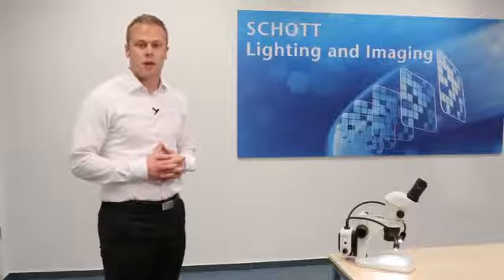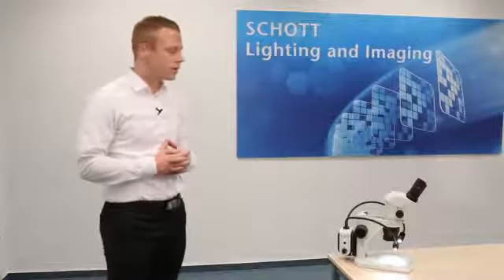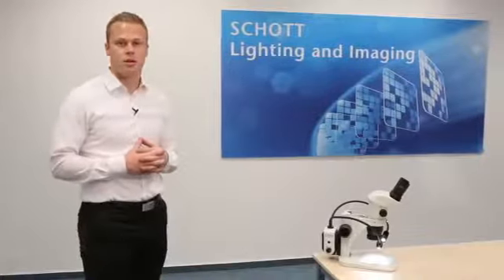Welcome to SCHOTT Microscopy. My name is Preston Zimmerman. Today I'm going to be demonstrating the EZLED Spotlight Plus. This is a very nice tool for any stereo microscope post and, as the name indicates, it is very easy to use and great for routine inspection tasks.